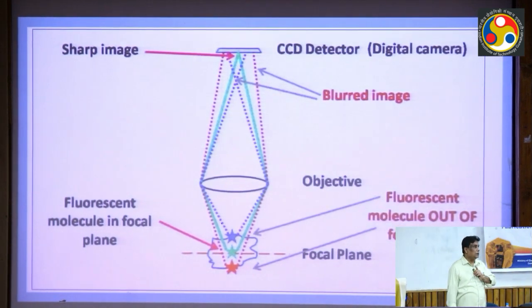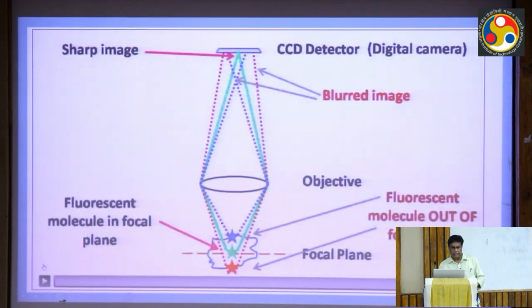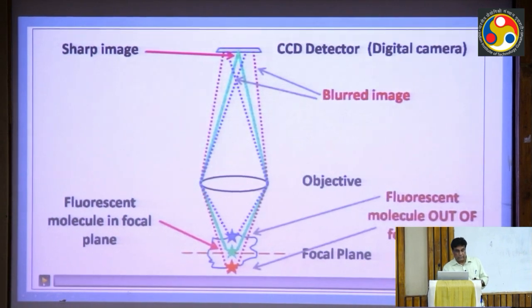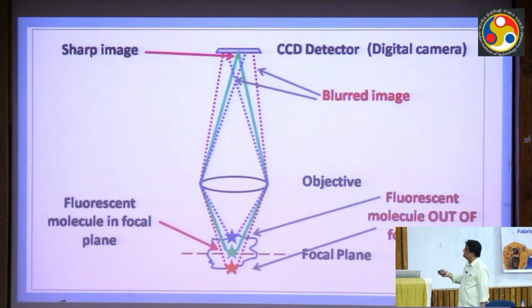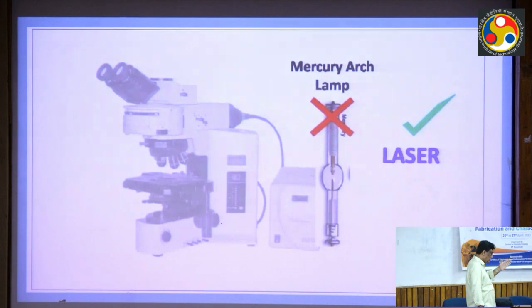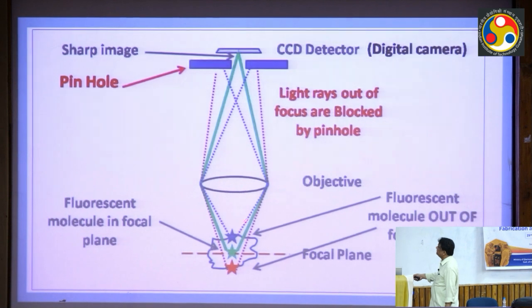Here, you will get the total view of the fluorescence microscope in the process. So let me run the video and explain to you one by one how the confocal microscope works, what the concept of pinhole is, and how the images are captured. So let's run it. So that's the animation. You see, this is the plane of focus. Instead of the mercury lamp, we have the laser. That's the first change from the fluorescence microscope to the confocal microscope, right? Then you have the pinhole over here that is already shown. It allows only the green light to pass on.